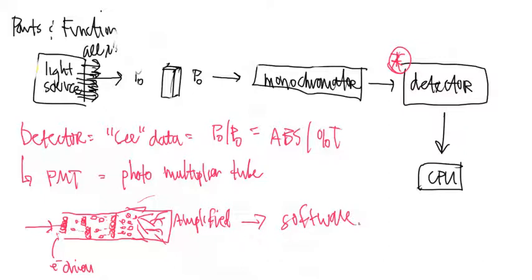Okay? These detectors, the PMT tubes, they are not cheap. The PMT tubes are anywhere between $2,500 to $3,500 if we're using them in the old school instrumentation. We've actually not had to purchase one for a new UV Vis, so I would hate to see what those would cost. But we've had to replace them for the old ones, and this is how much these detectors are running. So the detector is quite a bit of money. And when you're talking about a machine that's $9,000 or $10,000, and that one detector is anywhere from $2,500 to $3,500 of that money, then this can be expensive and it can get outrageous.